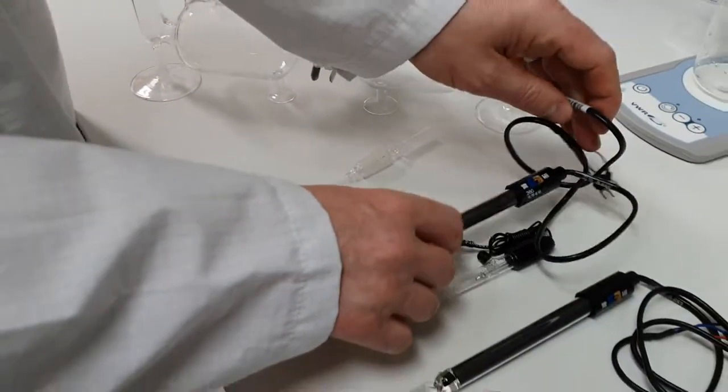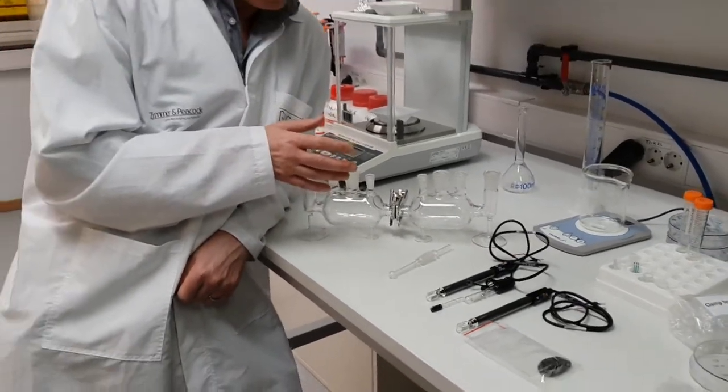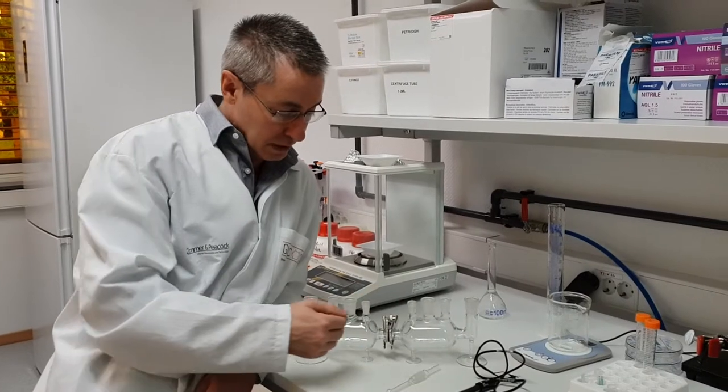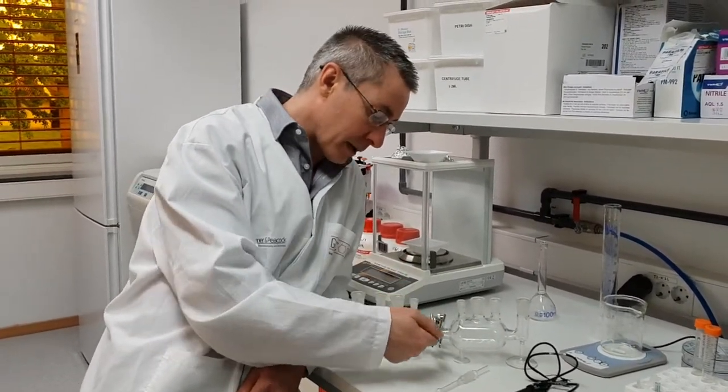So a quick summary. This is the Divanathan cell from Zimmer and Peacock. You have two half cells which have an approximate volume of 100 milliliters each. There's these lugging capillaries.